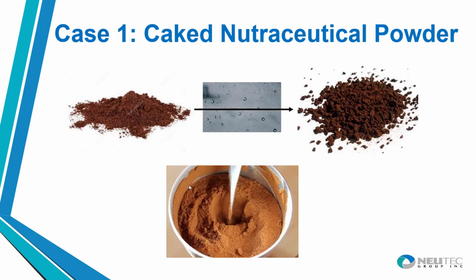And the problem with that is that when you take a caked and clumped instant powder and you try to put it into liquid to make a beverage, it's really difficult to get those clumps to solubilize. And so what you end up with is a very clumpy beverage, not real desirable to drink for a consumer. And so at that point, the consumer is likely to reject that product, and as a consequence, there's a complaint made, and then there's the potential for a reputation to be built for this particular product that it's not good. And as a consequence, this company faced the possibility of losing millions of dollars of lost product.